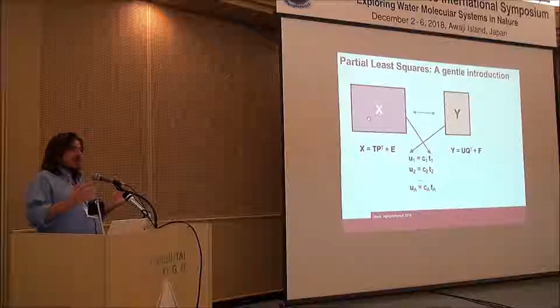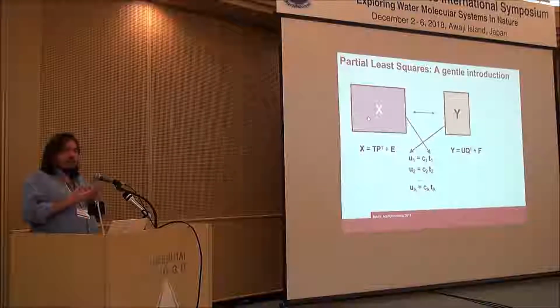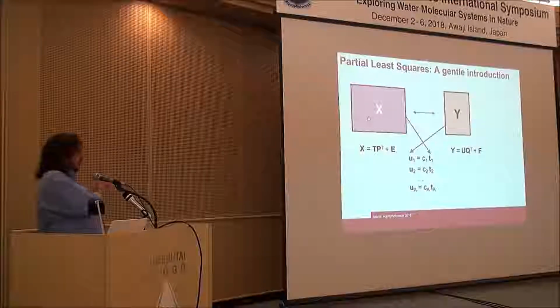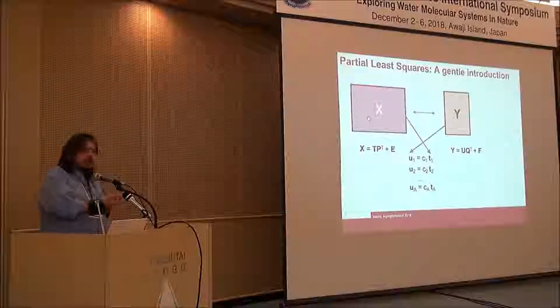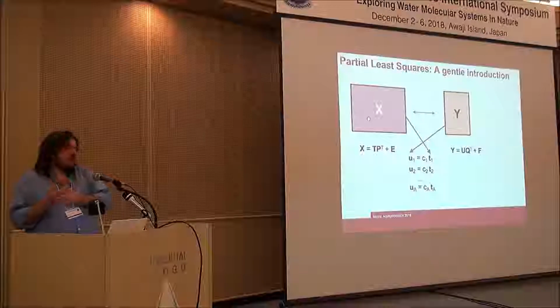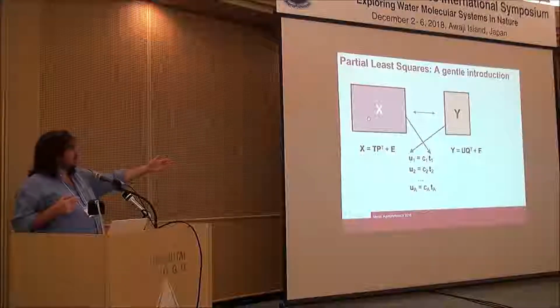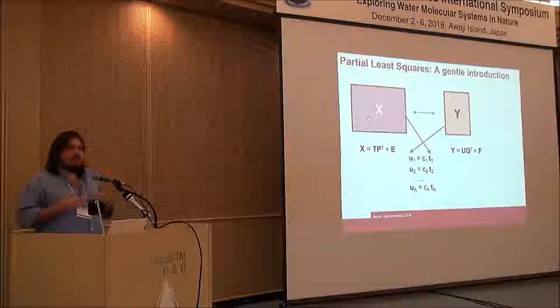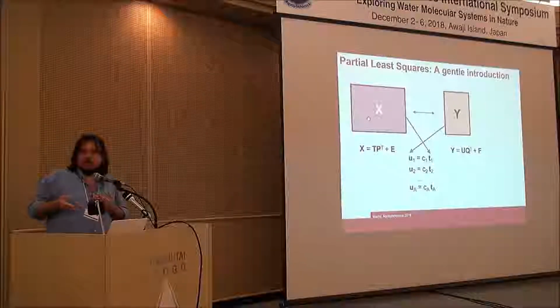So what's the idea? I want something that gives me the underlying structure of my data, both in the predictors, in my spectra, and in the property or properties that I want to analyze. And in the general case, I may want to predict more than one property given the same data set, so I will have multiple columns with responses.